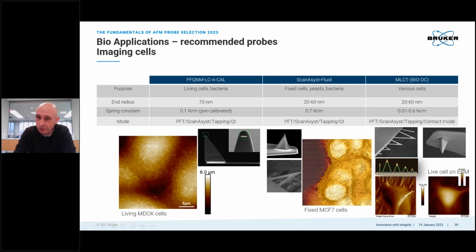These drift compensated probes, a lot of the low spring constant probes, have full backside coatings. So then you can be liable to a bimetallic effect. Most things expand or contract when they change temperature, and at different rates. So if you have silicon nitride and then a metal layer on top, and then you put that in fluid, or you put a laser spot on top that could heat it up, or you're actually using heating and cooling accessories, they will change temperature and expand or contract at a different rate, and that will tend to flex the cantilever one way or another.